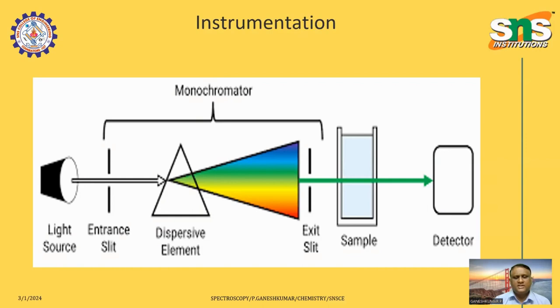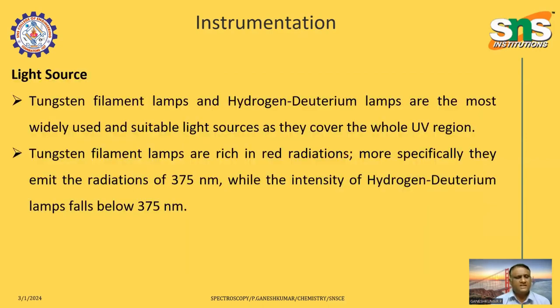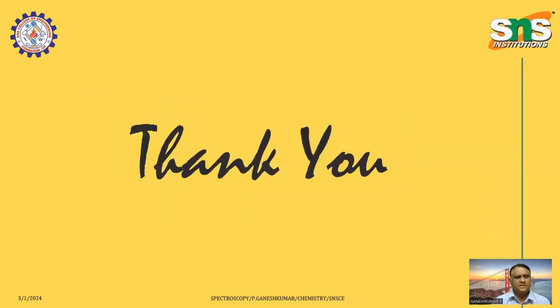In the next part, we will be discussing the sample container, the detectors, and applications.